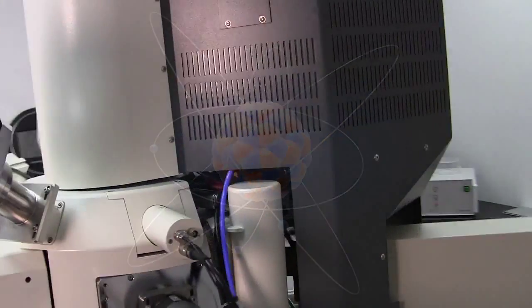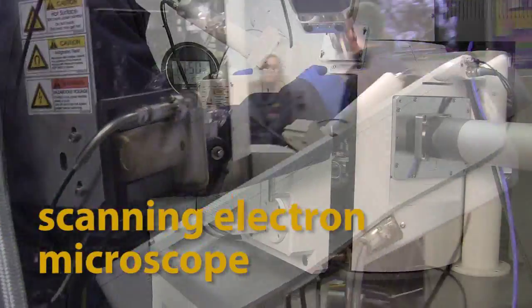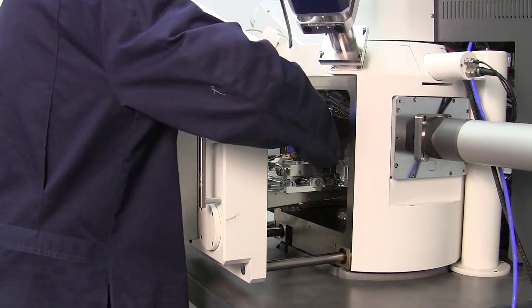This is called a scanning electron microscope. The sample we want to look at is placed inside this microscope. It works by focusing a beam of electrons onto the sample in the microscope.